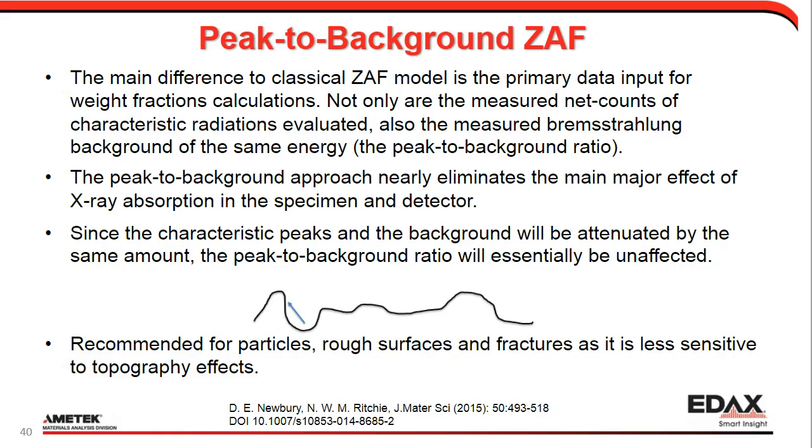So the peak-to-background approach nearly eliminates many of the major effects of X-ray absorption in the specimen and the detector. That means this model is recommended for particles, rough surfaces, and fractures, as it is less sensitive to topography effects.